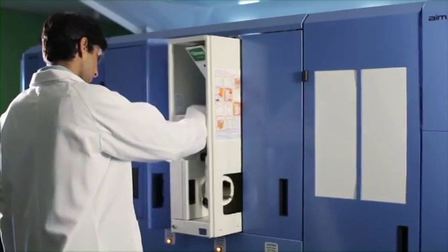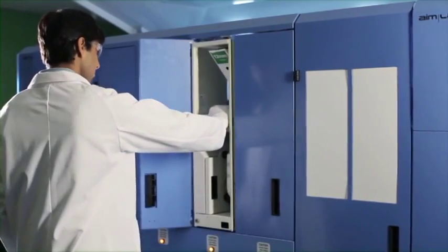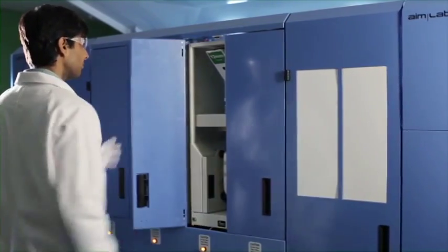Alternatively, it's possible to have two dedicated decapper modules and or two capper modules fitted.